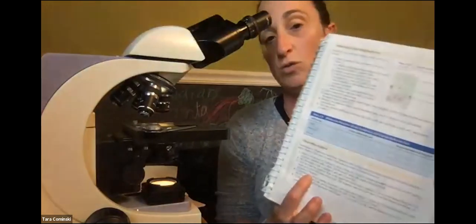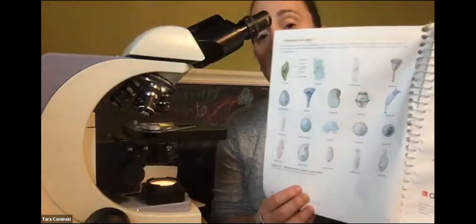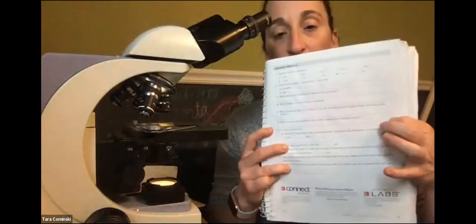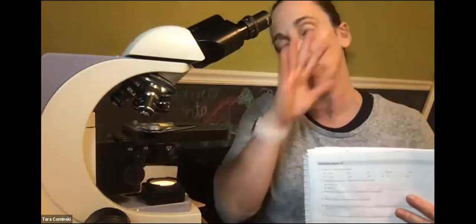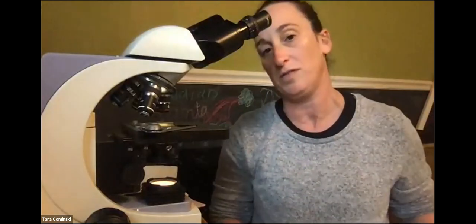Okay, so you should be able to fill in that table. We're not going to look at euglena. I don't have any euglena around. We're also not going to examine pond water. But again, you're responsible for filling out these review questions. I told you throughout what you should be filling in through the lab. You also then need to complete the review questions. That's the last part. All right, so let me end by sharing my screen to show you what our onion cells and what the cheek cells look like. And again, you have the pictures to help you with that as well.